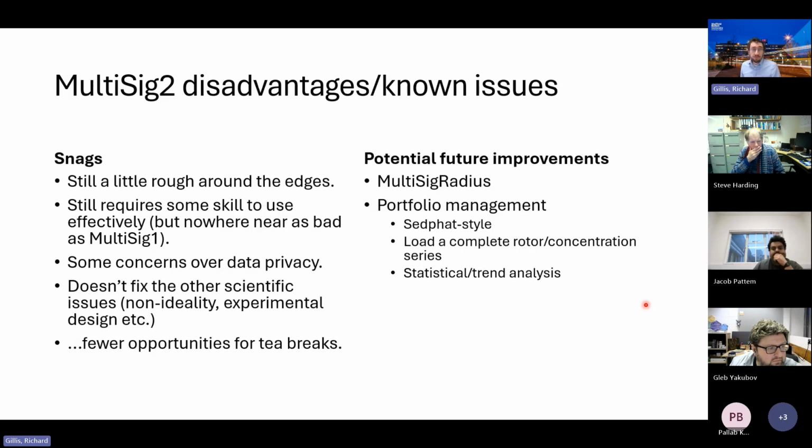Still some stuff that we need to work on. It's rough around the edges. We know about this. Also, two weeks ago when I initially showed this, it was multiplying all the numbers by 2. We haven't fixed that.